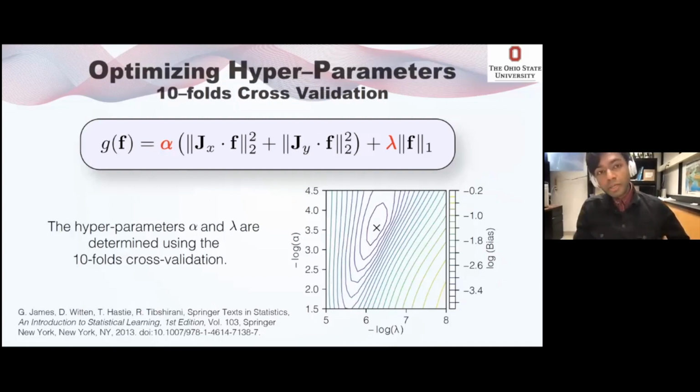So I've been showing these regularization terms, and there were 2 parameters that were always being used, which are the alpha and the lambda parameters. And in most algorithms, the alpha and lambda parameters are very difficult to pick, like what to choose for these values. So we try to overcome that. It's not something I am supposed to be providing to the solution, but the solution will find and learn the optimum regularization parameters that should be applied.